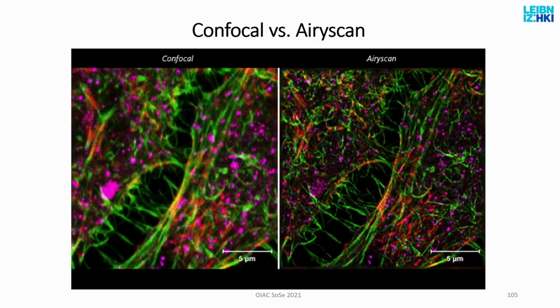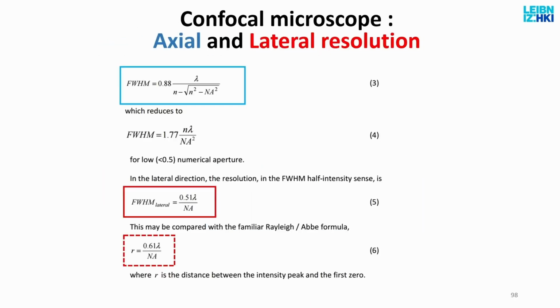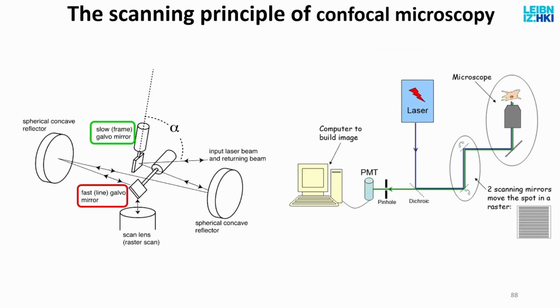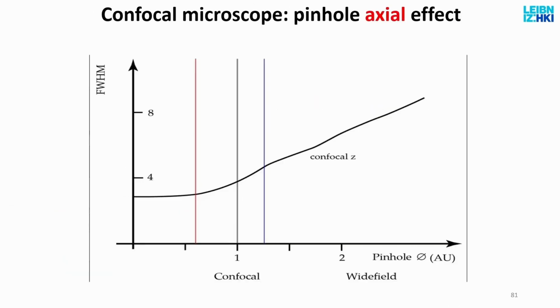Now, if I go back, I should have the second copy. If I go back to, sorry about that, here, what I did was, and this doesn't cost me time because I do the measurements in parallel with multiple AD converters. I measured this curve here, here, and here, and here, and here.